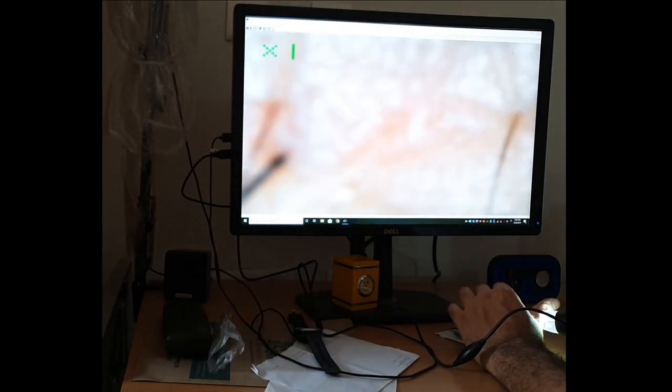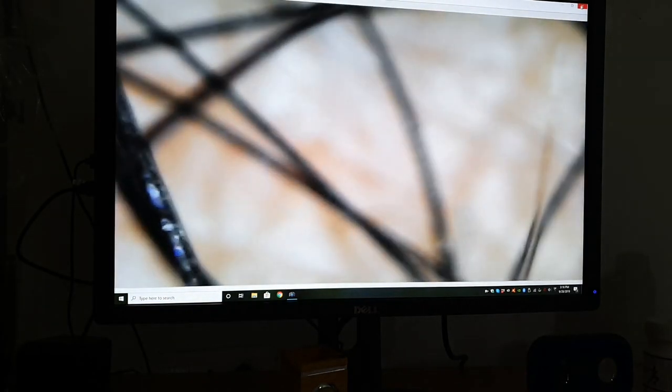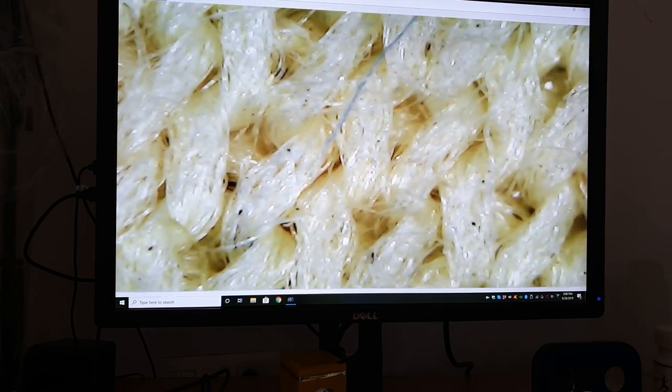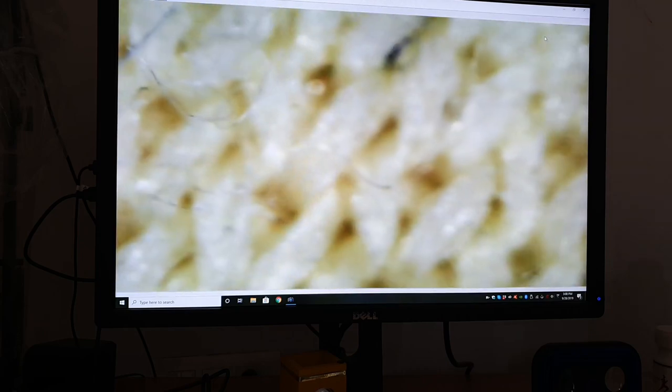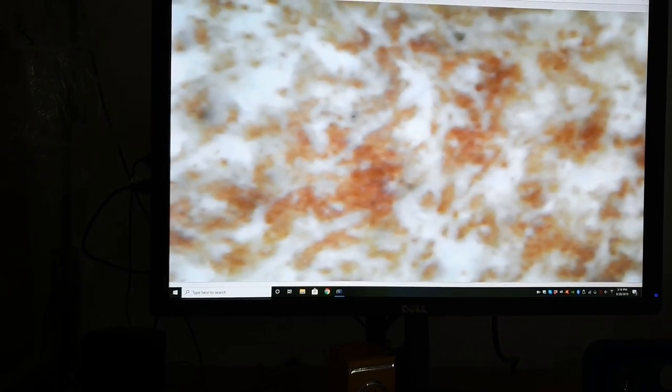And those are hairs — they're actually shining. Look at the skin, it's so clear. Those hair strands look really scary on your hand. Looking at the fingerprints showed me more than just fingerprints — I could literally see through my skin. My favorite of all these is the cloth fiber; it's so clear, there's so much dirt in between which you can't see with your regular eyes. I also just put this directly on my table — it's a particle board table and you can see the amount of glue they're using. It's just crazy.